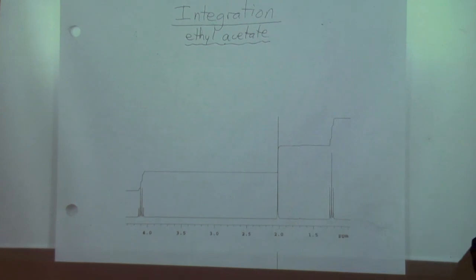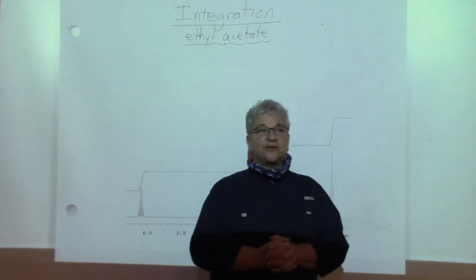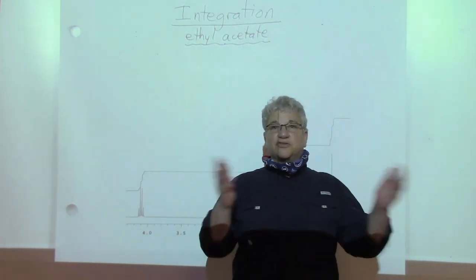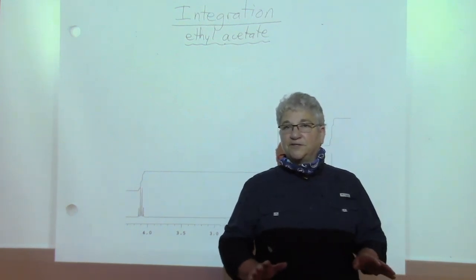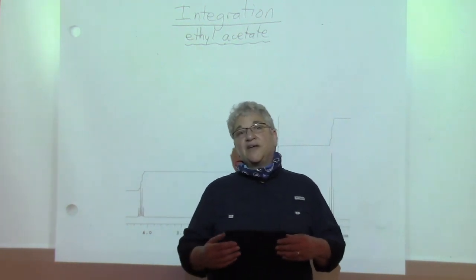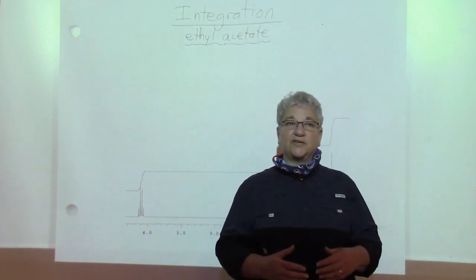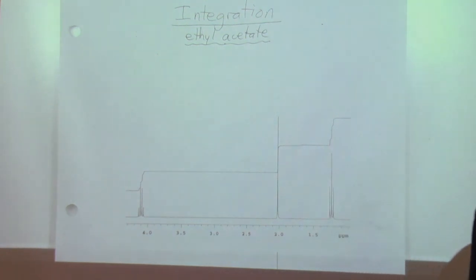Welcome back. So what we're going to talk about now is the idea of integration. And integration is not something that we did with carbon NMR, right? So yes, chemical shift is similar between carbon and hydrogen, but the next two ideas, very different, right? And that's often why between integration and splitting pattern, that is often why a proton NMR is the go-to for organic chemists, right? Because we can actually get so much more information from it. So let's talk about integration.